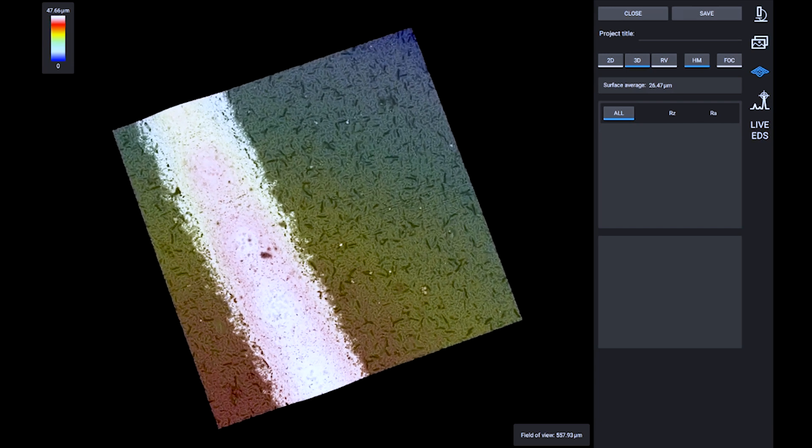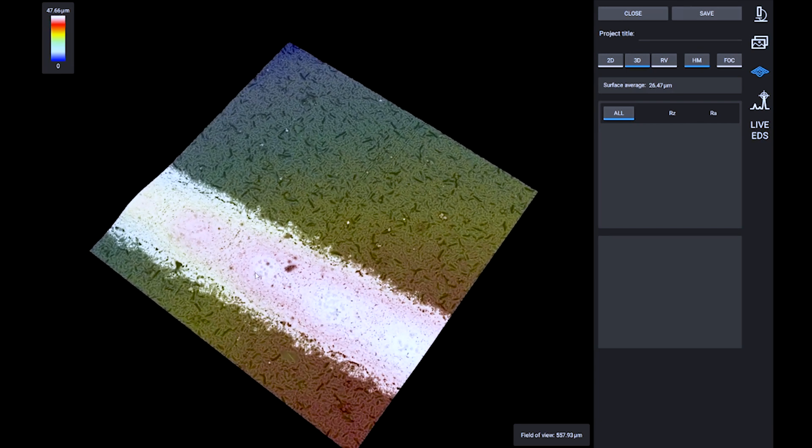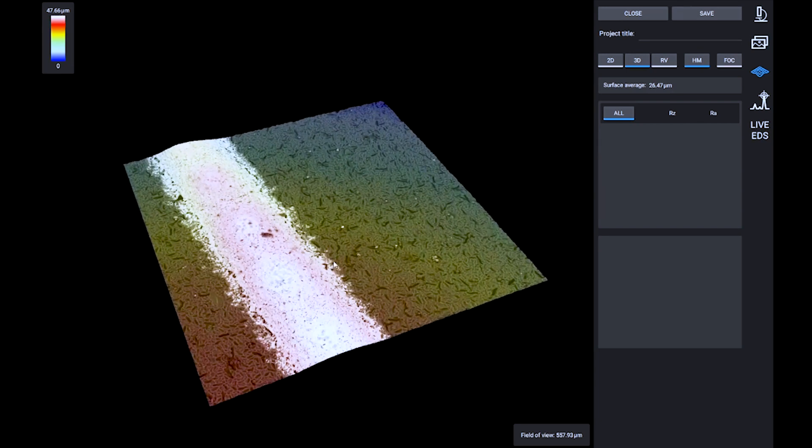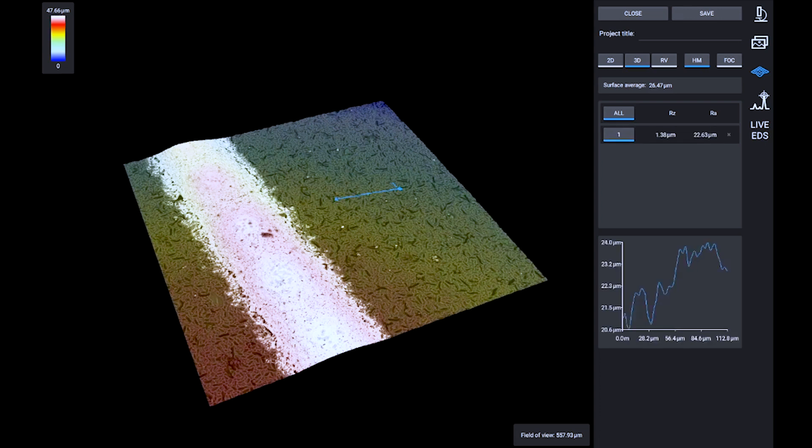As soon as the model is displayed on screen, we can move it around with the right mouse button, or we can trace a roughness profile with the left mouse button.